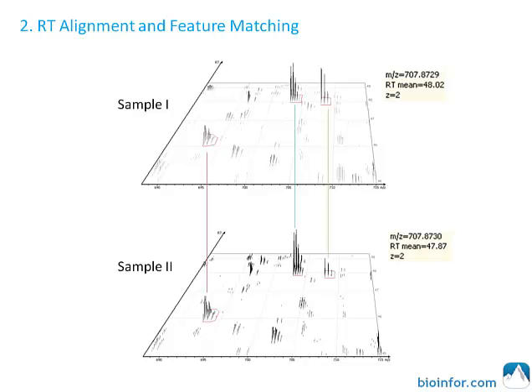Here are two LC-MS runs. You can see where the retention time changed. After the alignment, the peptide features are matched.